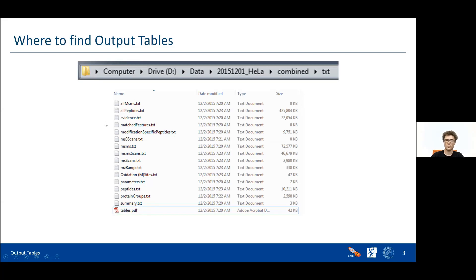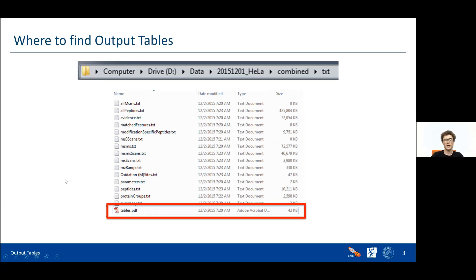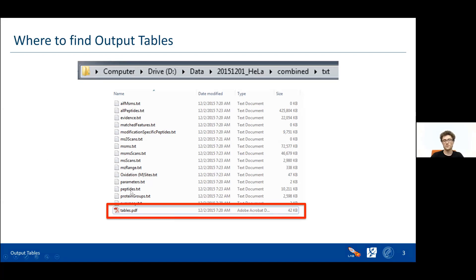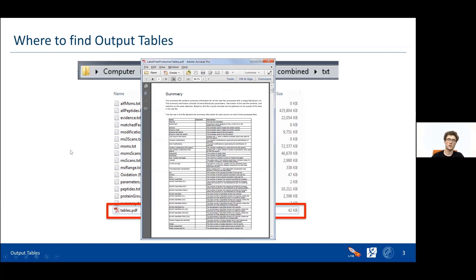There are many different output tables there, and we'll cover now what they actually mean. The most important part already highlighted — I'll highlight it in red — is this PDF file. It's called 'tables' but it's actually a help document, because it helps you understand what all the column names actually mean in all the output tables. If you're not sure what something means, you can look it up in this PDF. It's pretty long, as you can see, because the tables are pretty long and there's a lot of data to discover.